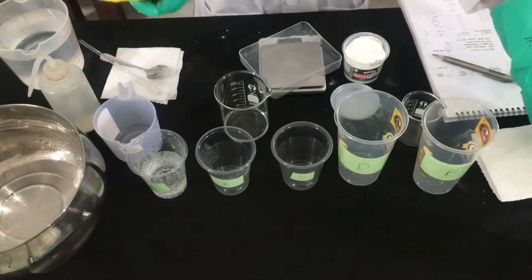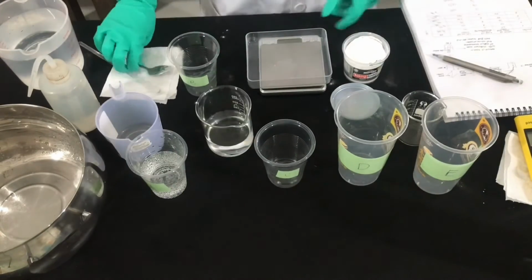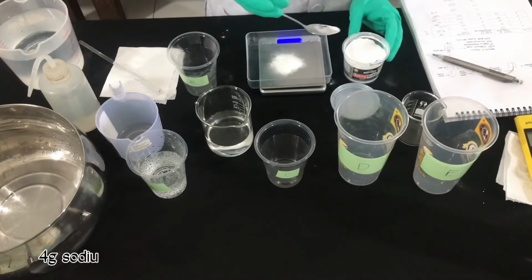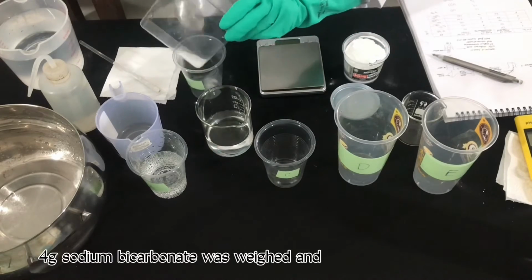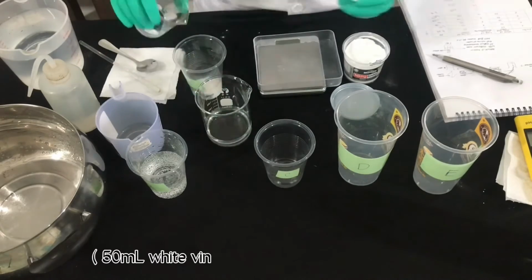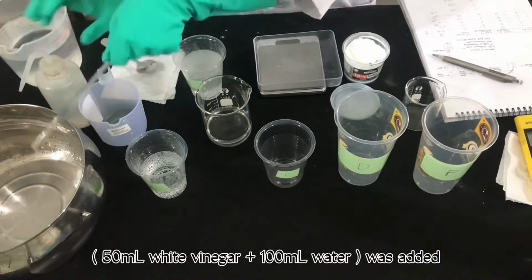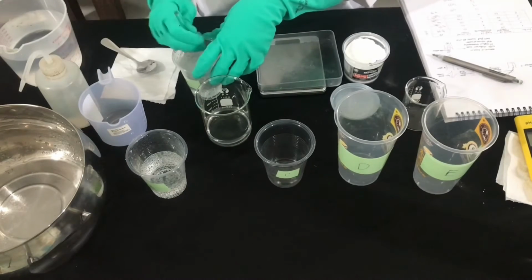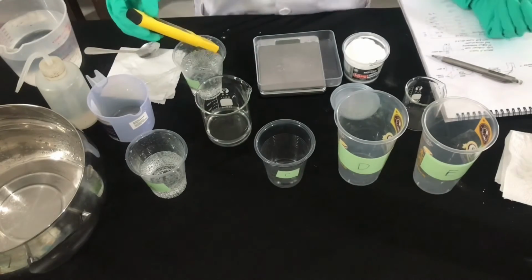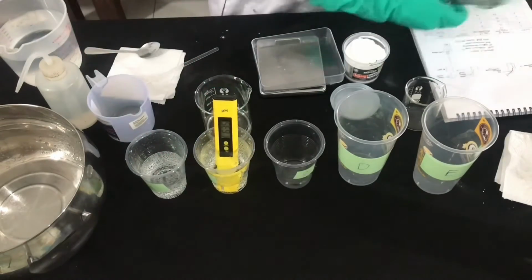Now I prepare 4 separate plastic cups labeled B, C, D, and E to find the neutral pH 7 solution. For cup B, 4 grams of sodium bicarbonate was weighed and transferred into the plastic cup. Then 50 ml of 0.83 molar white vinegar and 100 ml of water was added. I stirred until all the sodium bicarbonate was dissolved. Then the pH value was measured for cup B and I get 6.35.